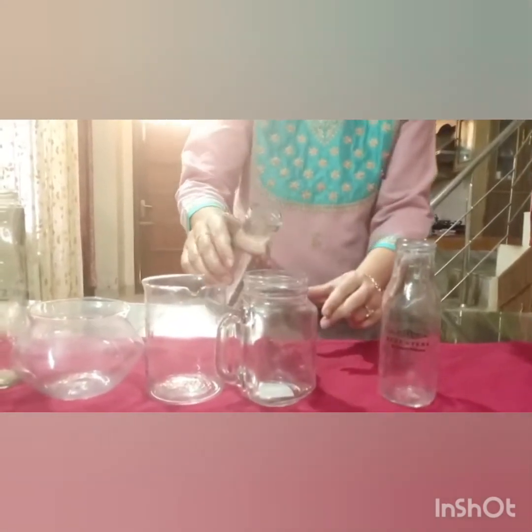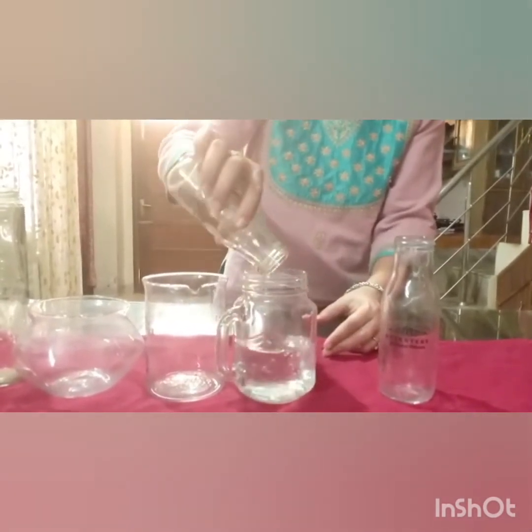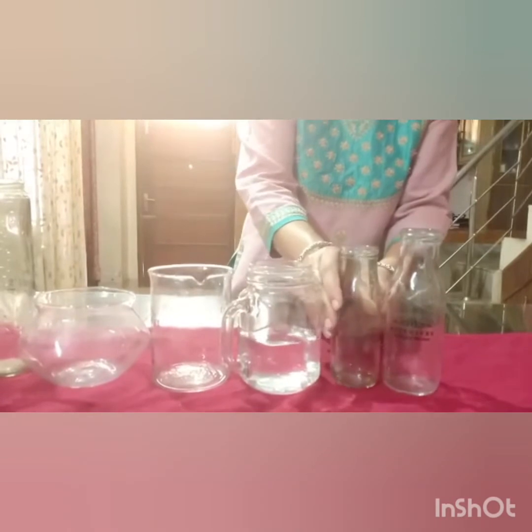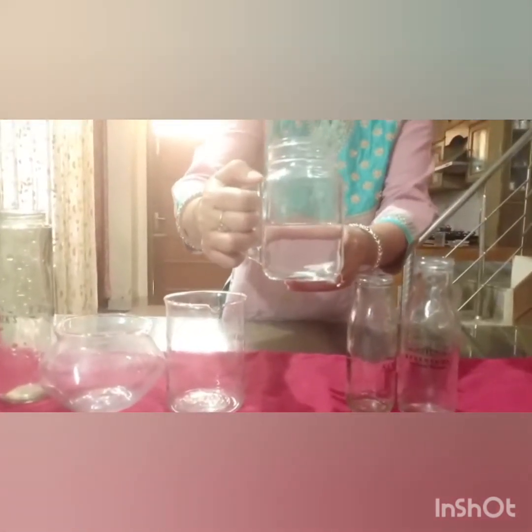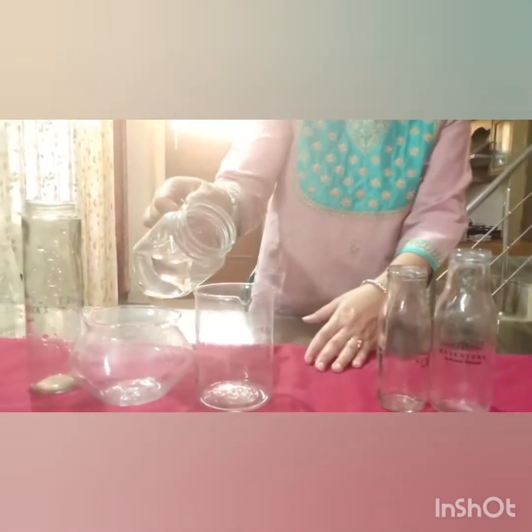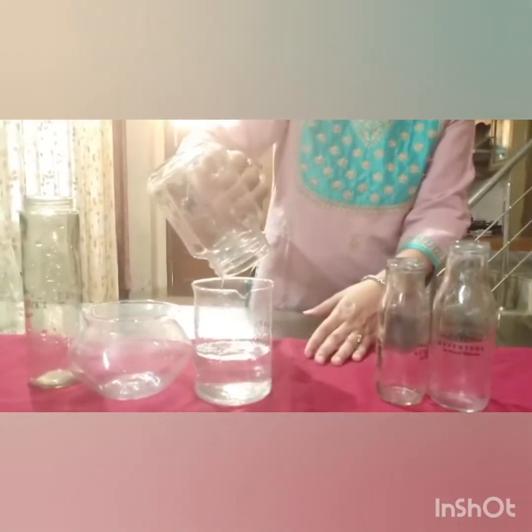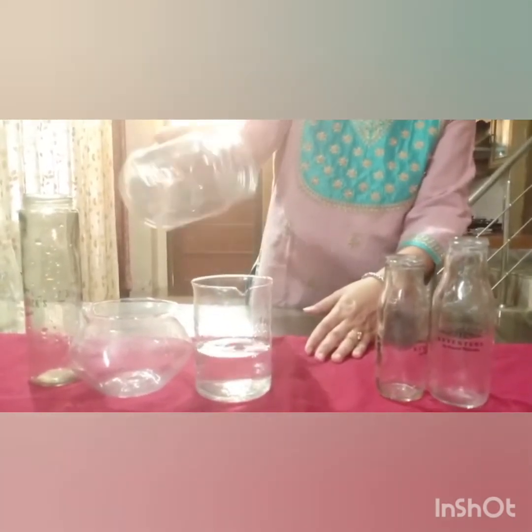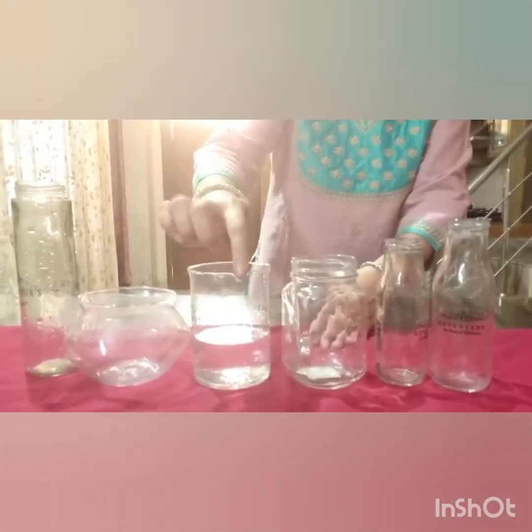Now I'll pour this into another jar with a different shape. So this is my new shape of water. Now I'll pour it into a beaker. The beaker has a wide mouth, open mouth and a lip to pour the liquids.